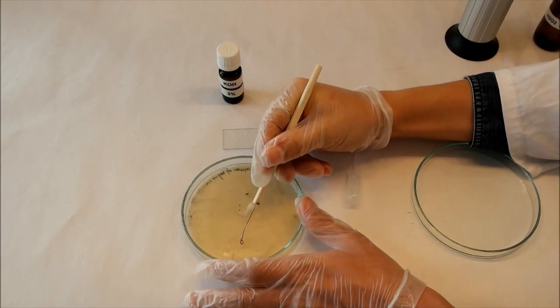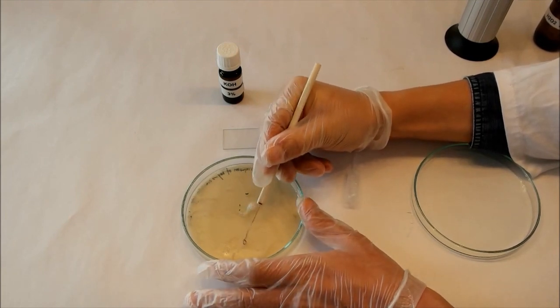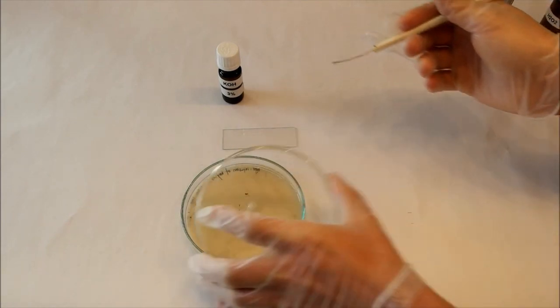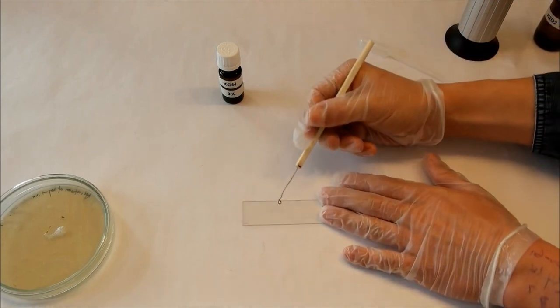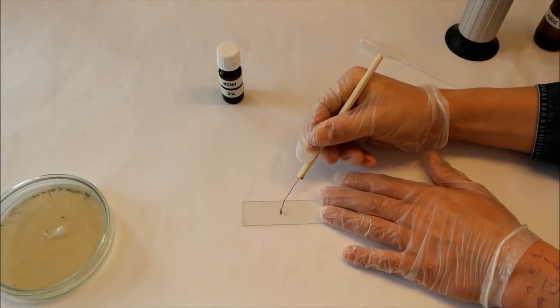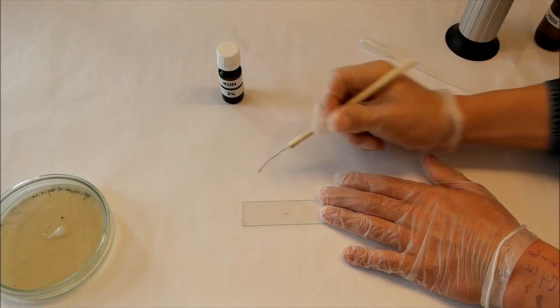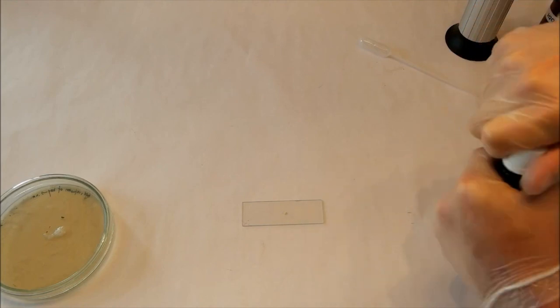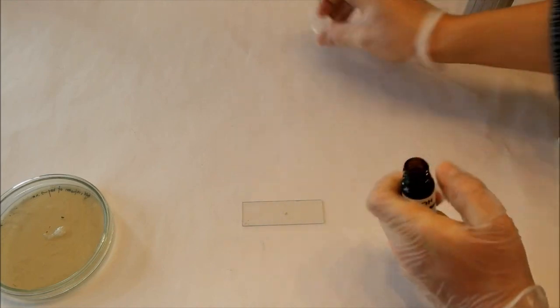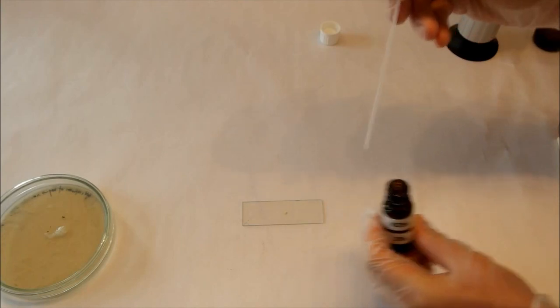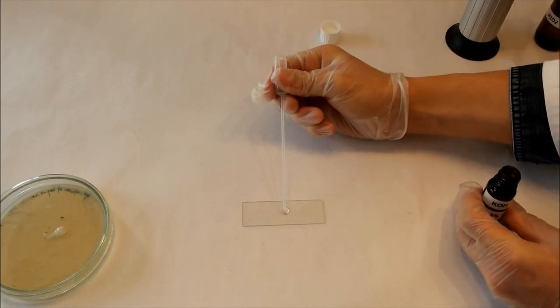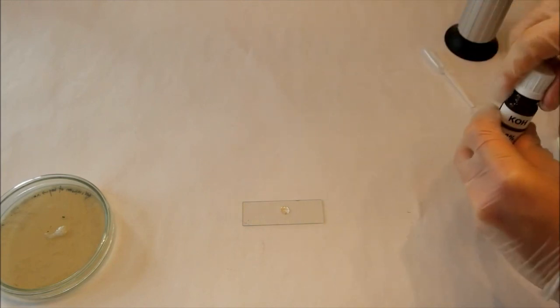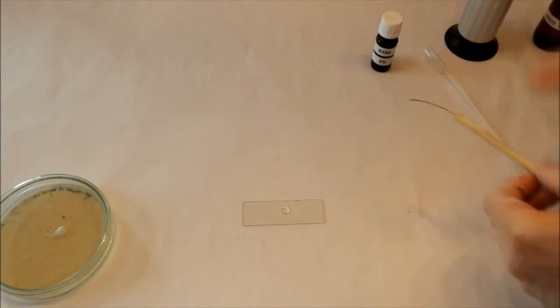I'll take this one. And now I've got bacteria on my loop, and then put it on this glass slide and mix this with a drop of potassium hydroxide solution. That's enough. And make sure to mix it very, very well.